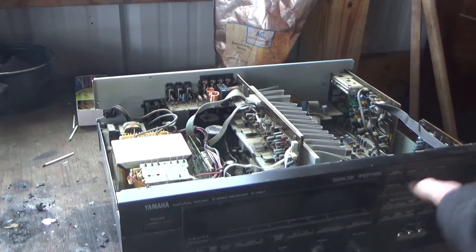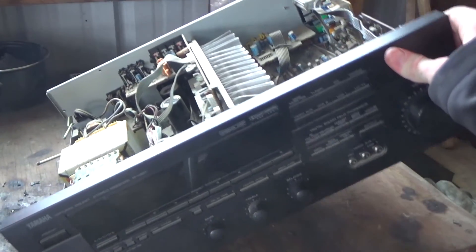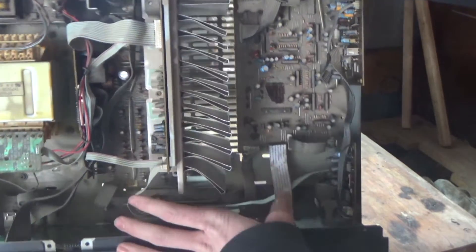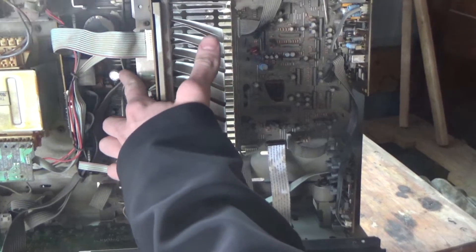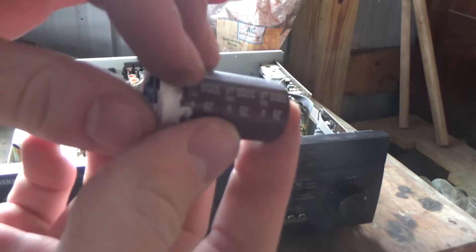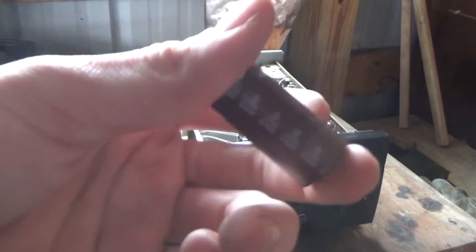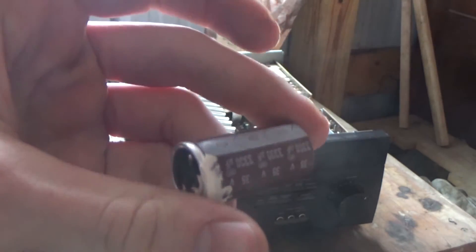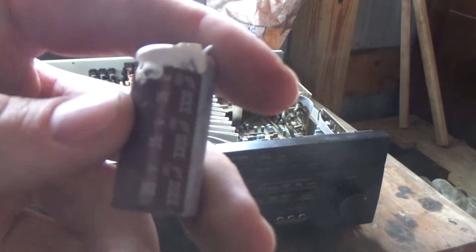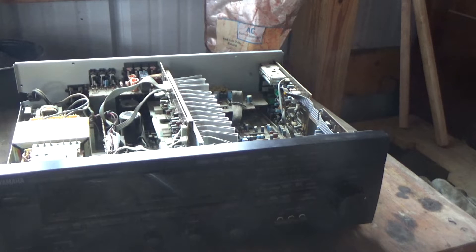I got pretty lucky and found this old TV — and if you look in here you'll see these things called capacitors. Today, sometimes they have pure tantalum metal in them, so I'm going to be trying to extract that tantalum metal from these capacitors and see if we can get some tantalum metal.